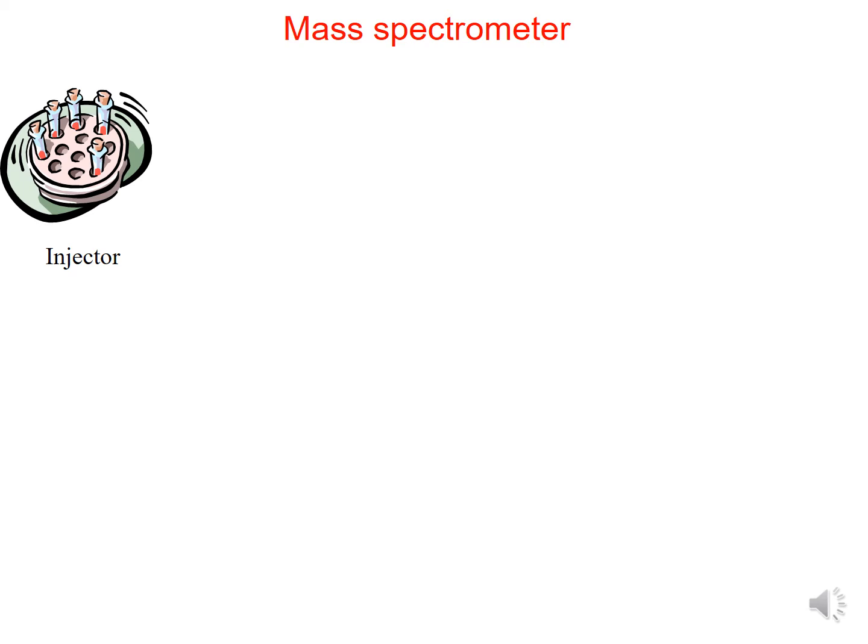So now I finish about the fundamentals and the principle of mass spectrometry, and I will speak about the mass spectrometer, because the mass spectrometer is very important in this methodology. You will see that there are different parts, and these parts take into account the fundamentals of mass spectrometry. This part takes a major role in the different steps to perform the analysis.